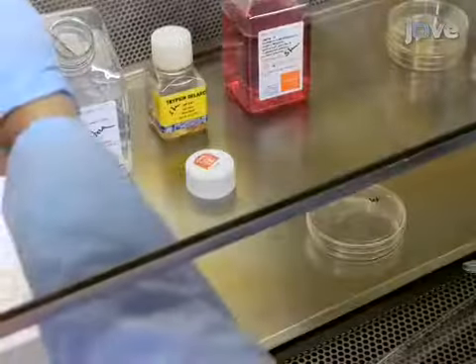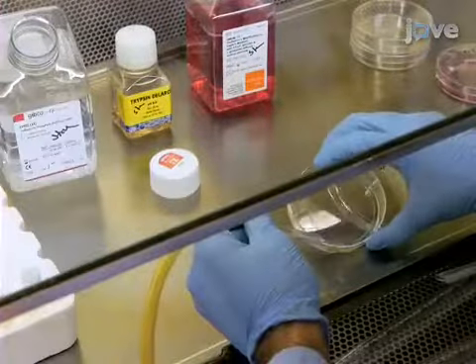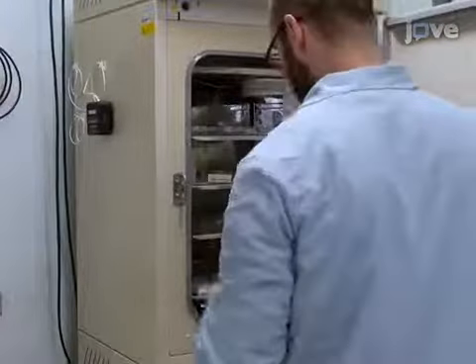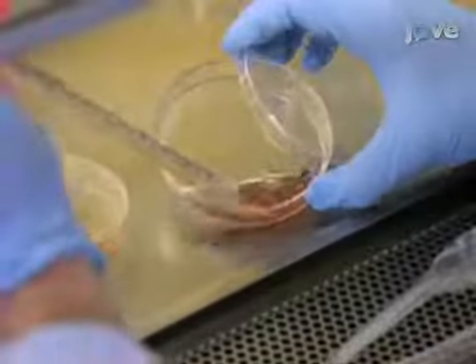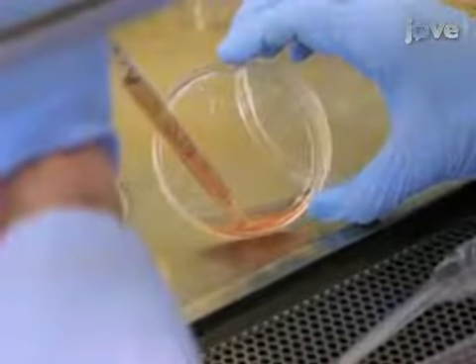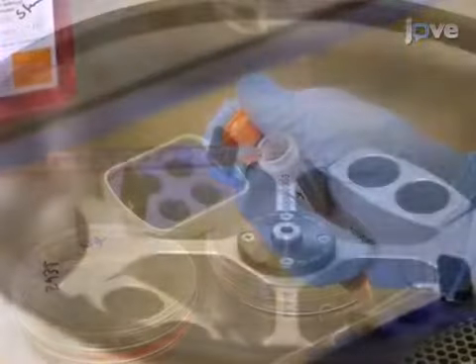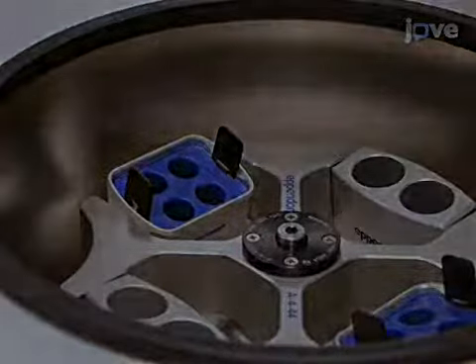Approximately 6 hours later, wash the 293 cells twice with PBS and then incubate them with fresh media for 48 hours. 2 days later, harvest the virus-containing supernatants from the 100 mm diameter dishes and clarify the supernatants by low-speed centrifugation for 10 minutes.